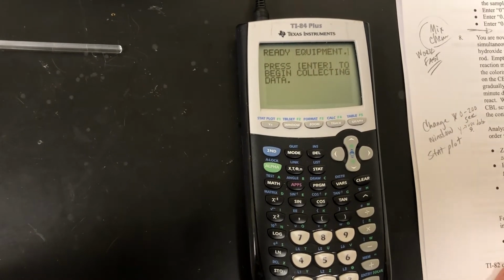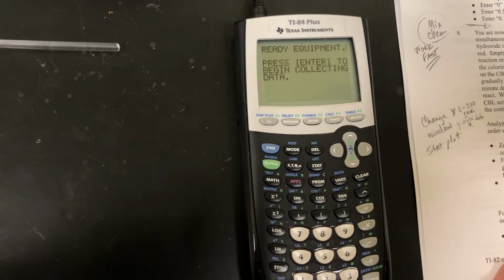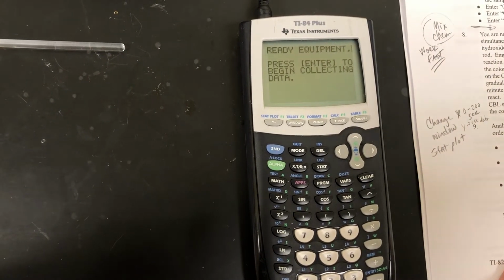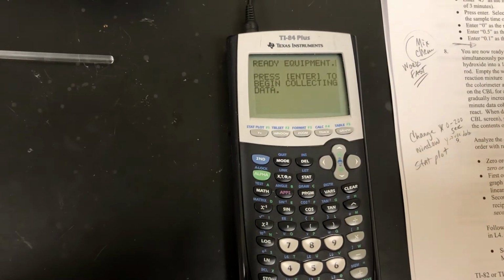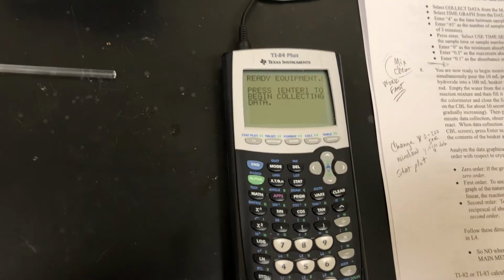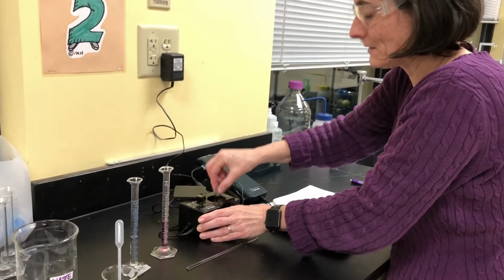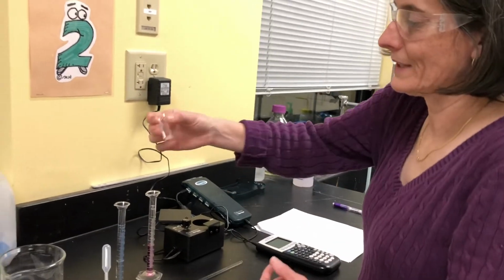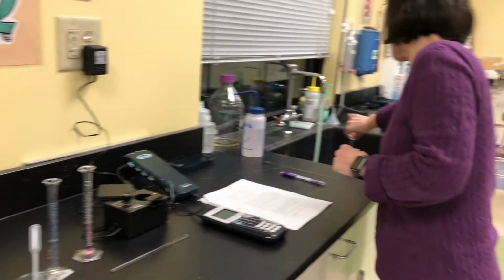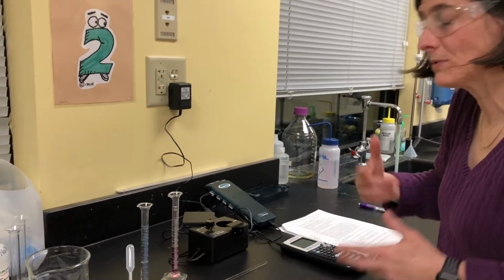All right, at this point, we have done all the work necessary to get the calculator set up to run the experiment. Now right now I still have the distilled water in here, and now's the point where we need to pause, mix our chemicals, and we want to work pretty quickly because the reaction is going to happen as soon as we mix our chemicals. So I'm going to go ahead and open my colorimeter, carefully take out my cuvette touching the ridge sides, and since this is distilled water, I'm just going to go ahead and dump it in the sink.